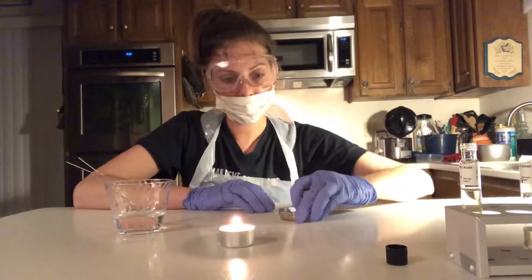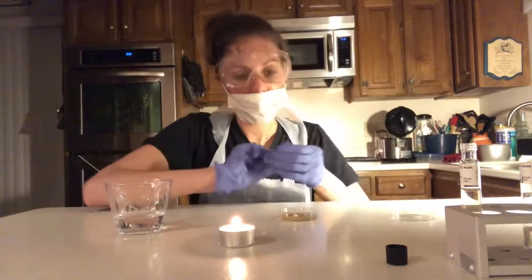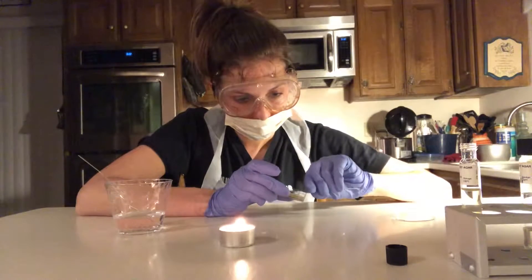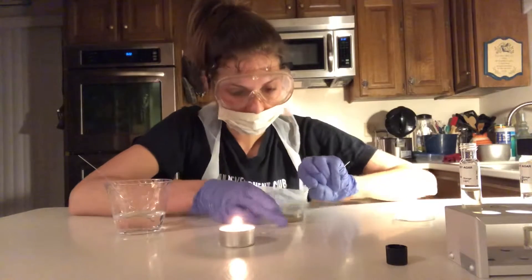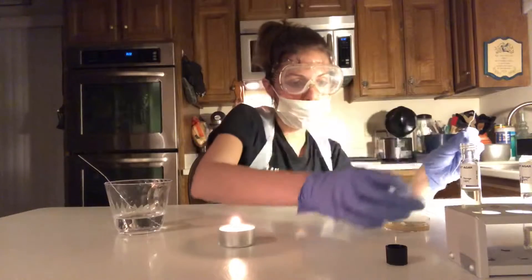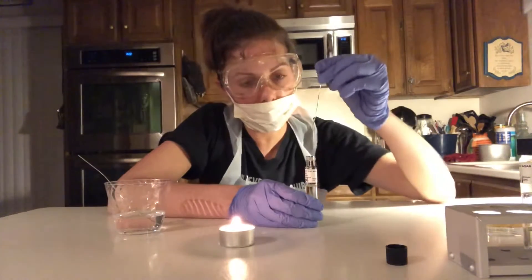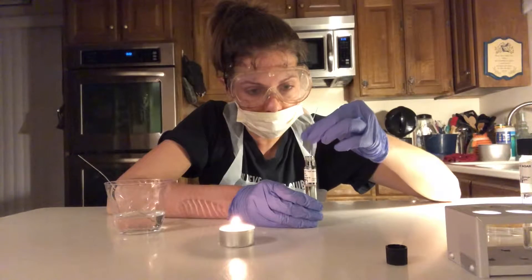I'm going to flip the plate over and take a paper clip that I've straightened out, sanitized with rubbing alcohol, and tapped dry. I'm going to scrape colonies using this paper clip, trying to get every little square inch. Now I'm going to take my motility agar tube for S. epidermidis and stab the agar all the way down and slowly bring it back up.